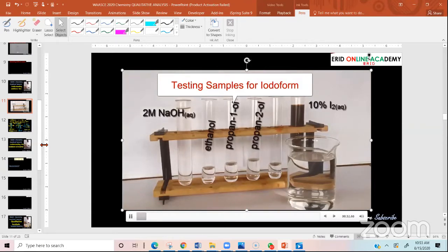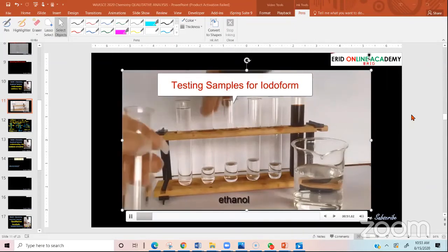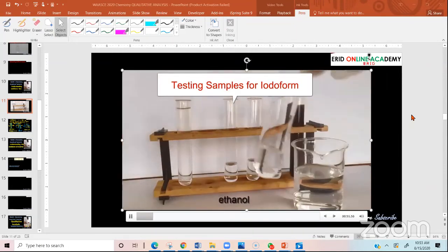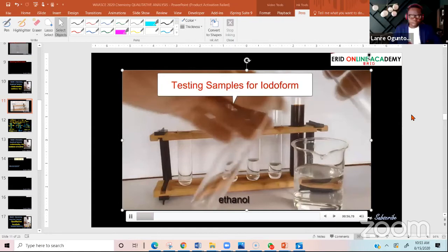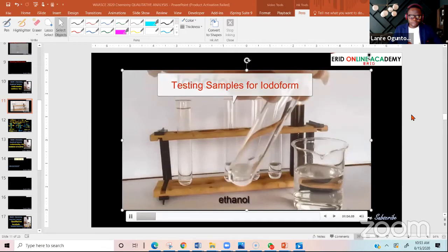And let's look at another organic solvent, butan-1-ol. I will also be needing hot water, which will serve as my water bath for this particular experiment. Let's take the first sample, which is ethanol. I will add some quantity of that ethanol into a fresh, clean boiling tube.